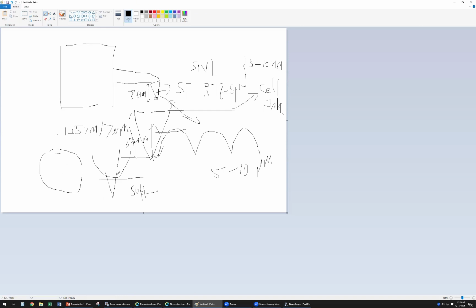So this probe is not silicon, it's a ball. This one's value is fixed. If you attach one ball on the cantilever, most of them are a few micron, and the 10 micron ball cantilever probe is more popular.